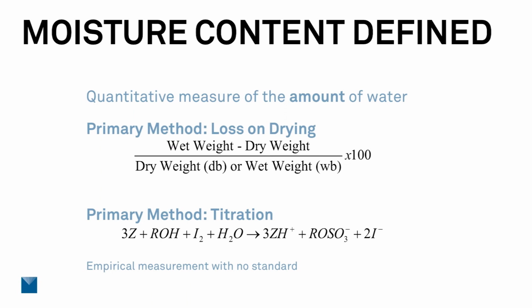For any method for determining moisture content, there is no standard. There's nothing that has an intrinsic moisture content of X to which we can compare. We can get an answer for moisture content, but we don't know if it's right.